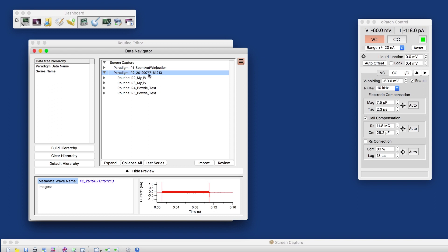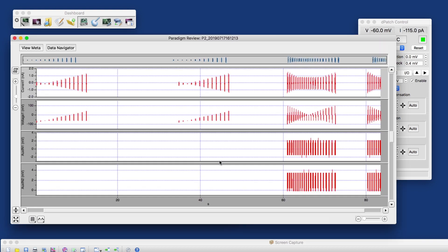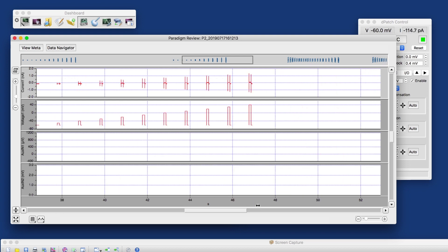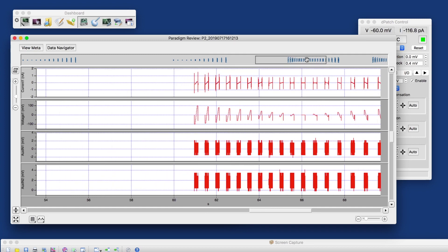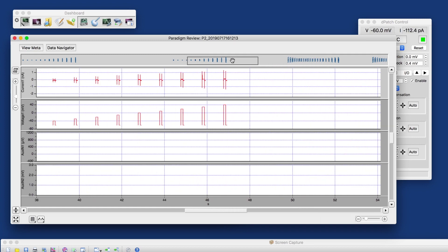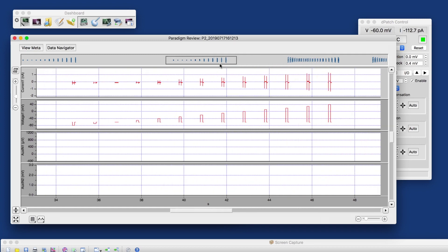And with the paradigm highlighted, I can review the paradigm data, which gives me the two IV routines and the one complete and one manually stopped Bowtie test routines. This window, by the way, behaves very similar to the reanalysis window that we saw earlier. We also got the overview navigator up here that we can use to go back and forth.